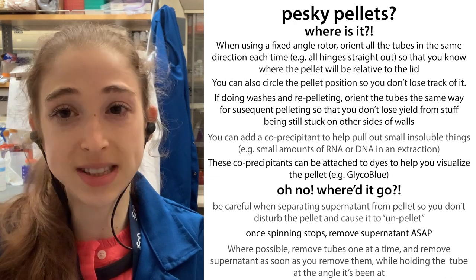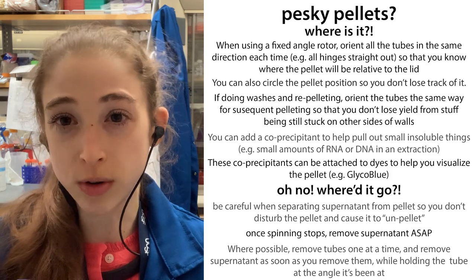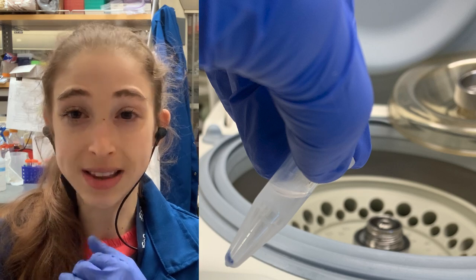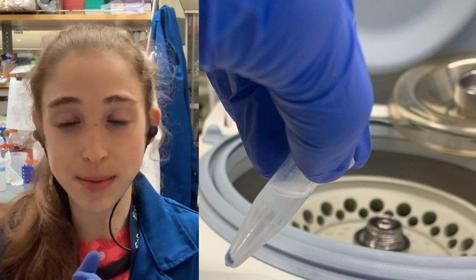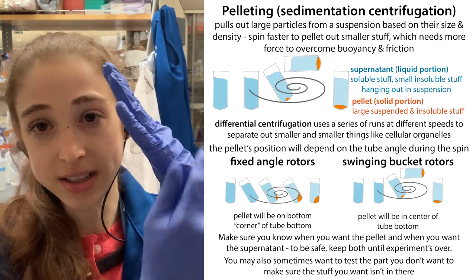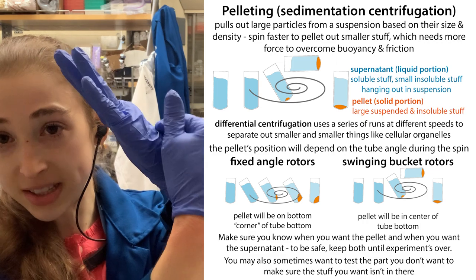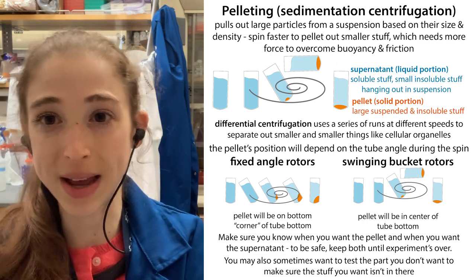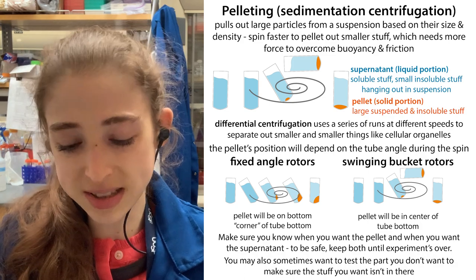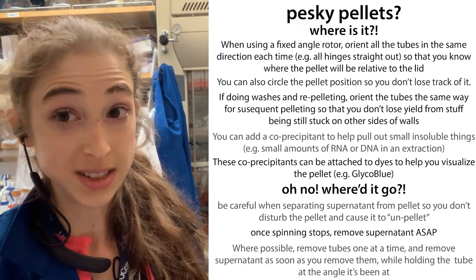It's helpful to put your tube in the orientation where — I always put it so that the cap faces out so I know exactly where the pellet will be. And when it comes out, you can kind of mark it, but it can still be hard to see. What can be helpful is if you add glycoblue — this has a blue dye conjugated, directly bound, to the glycogen. This is going to allow you to actually visualize that pellet once it pellets. This is especially helpful too because in a fixed angle centrifuge, instead of going directly to the bottom, you can have stuff on the side of the tube, and you might get these blue specks that would be hard to see or you'd probably scrape off if it wasn't dyed blue.